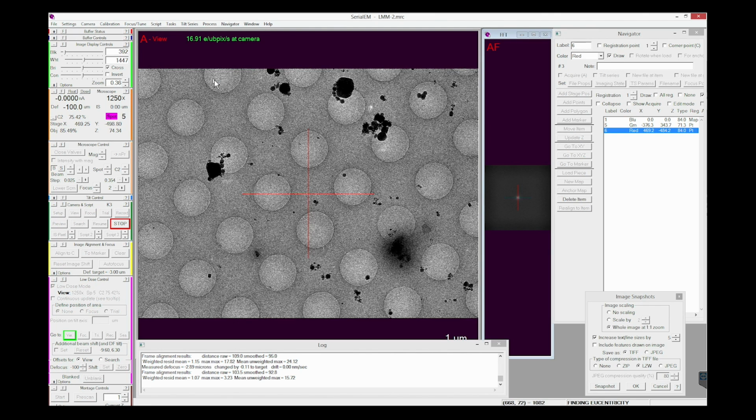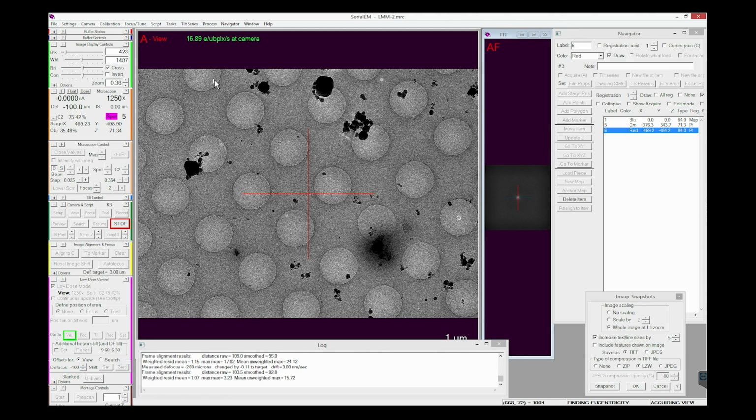Let's calculate rough. Sometimes the crack can have the carbon in 2 different heights. And so I don't like to calculate Z on a crack. So I'm to the left of the crack and we'll do all my screening over here. So everything will stay at the right Z.